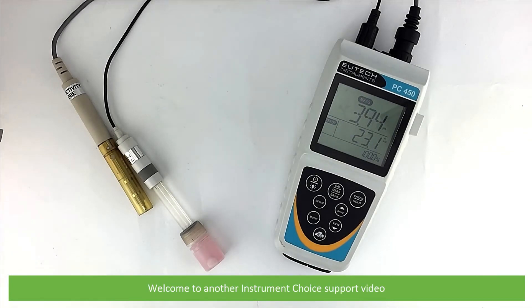Hi and welcome to another Instrument Choice support video. In this video, we'll demonstrate how to calibrate a waterproof PC450 meter.